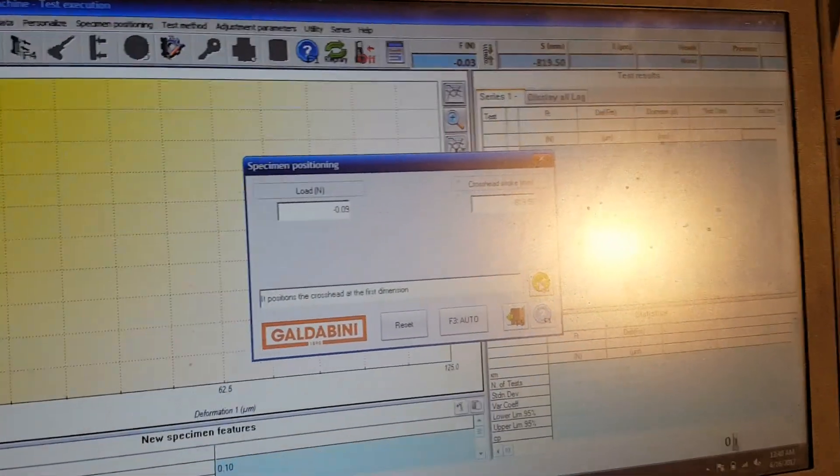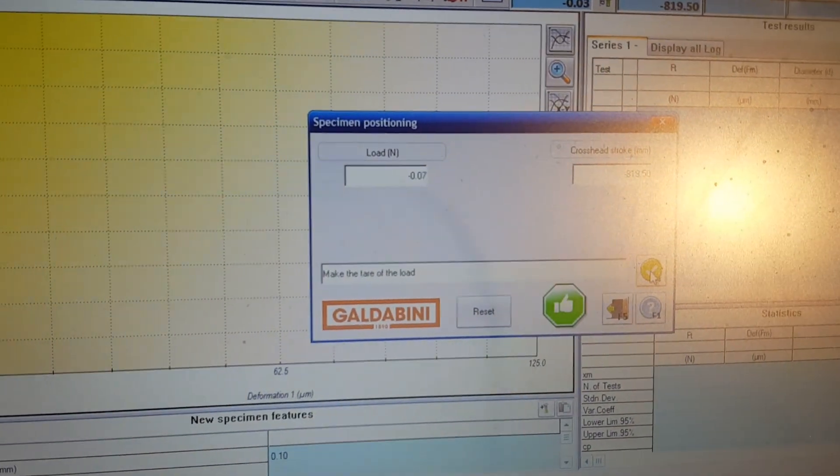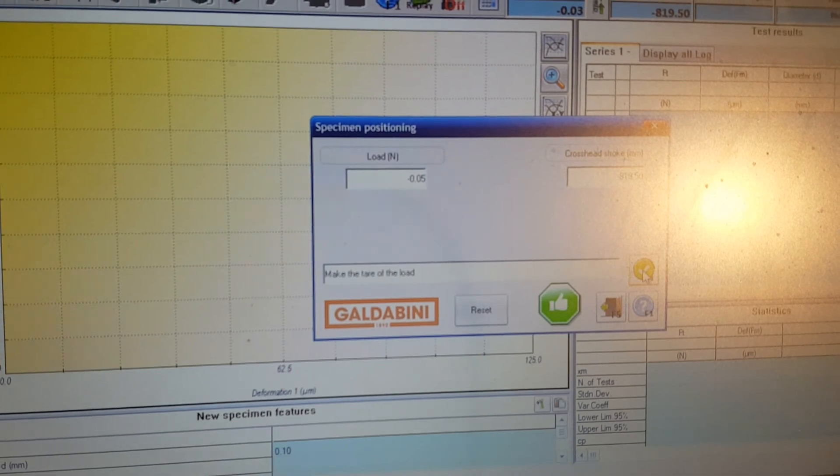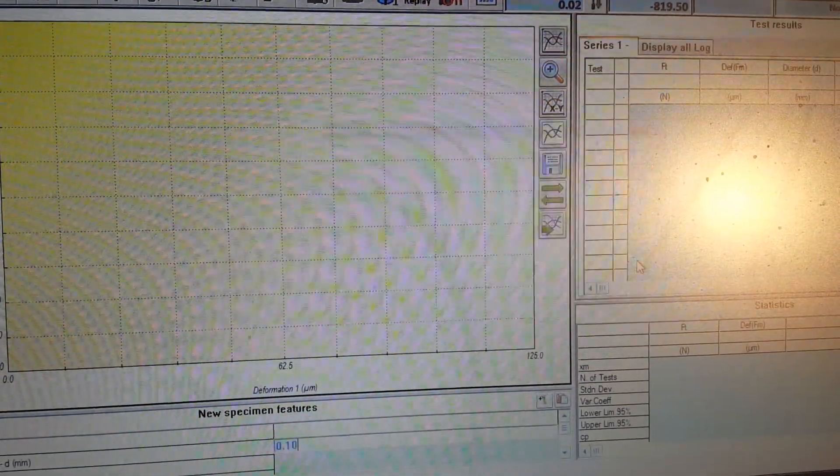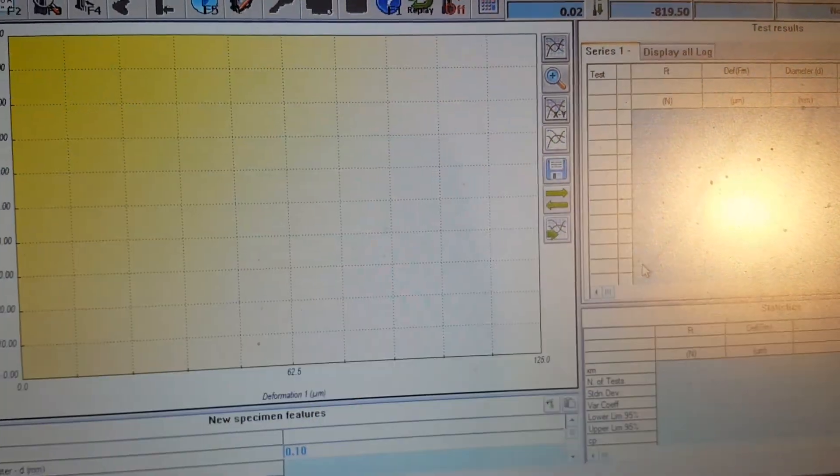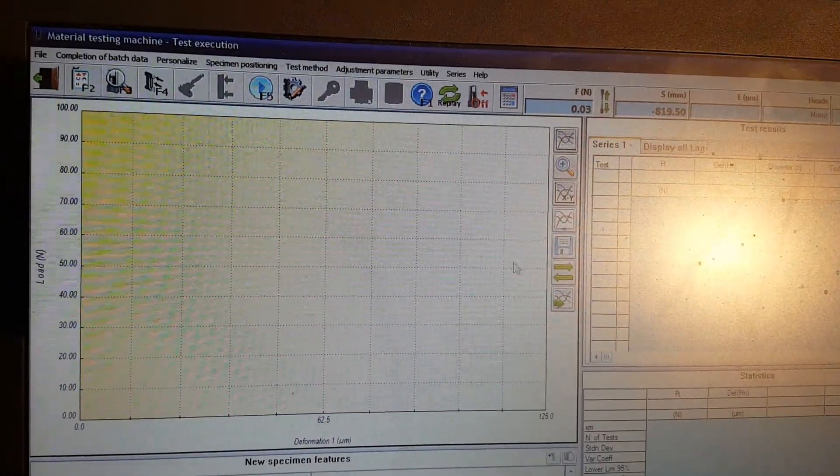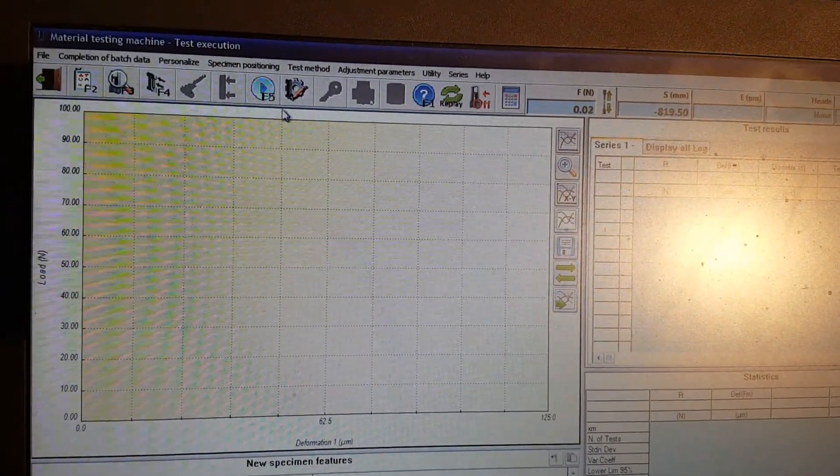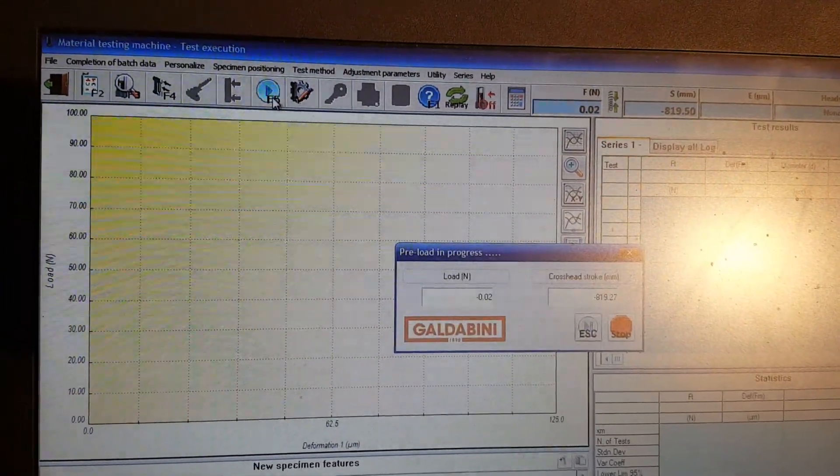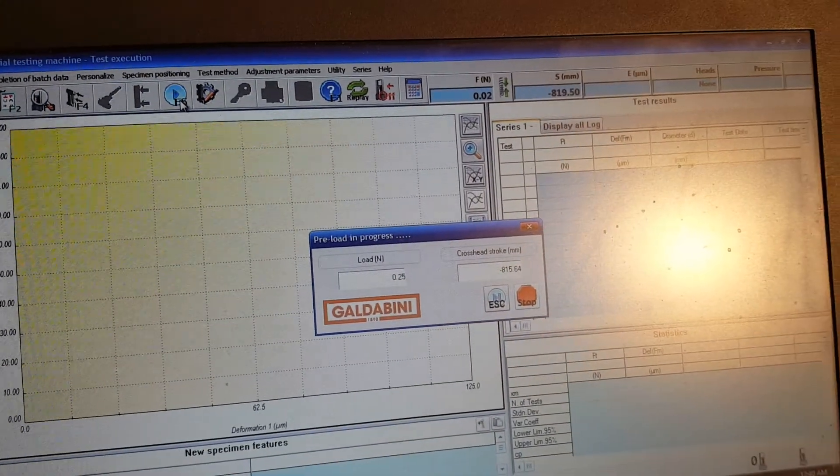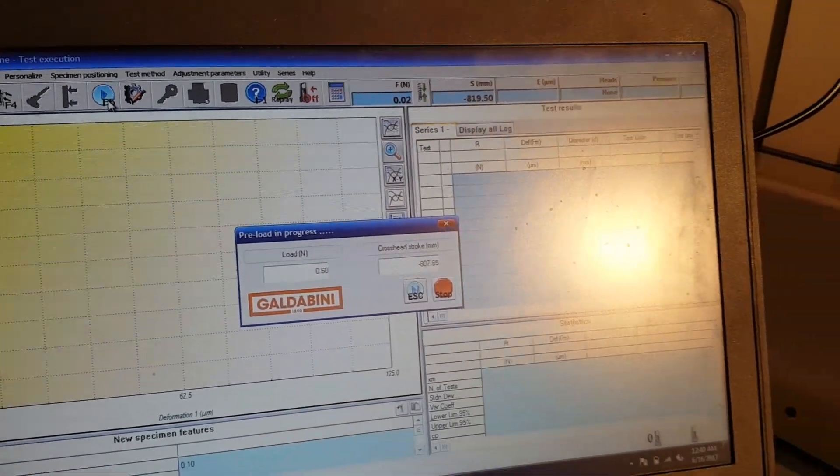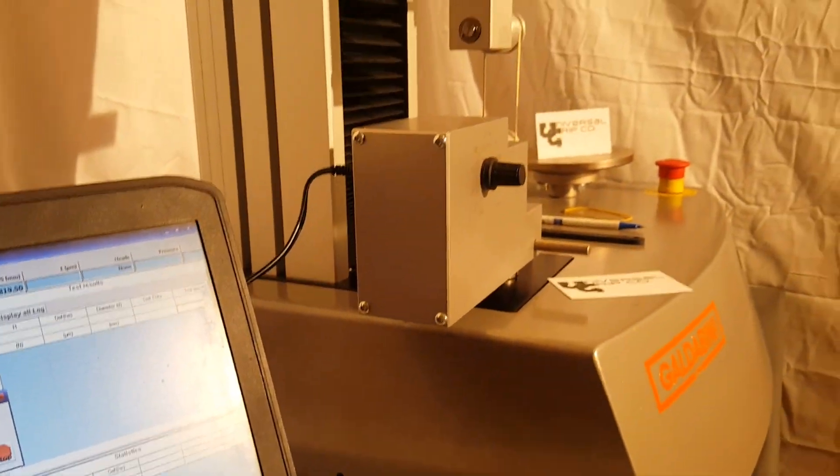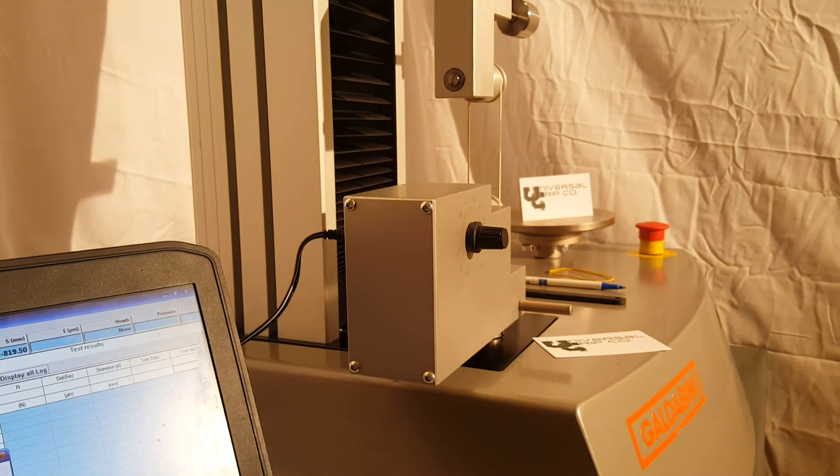First we tell the machine that the sample's in and ready, and then it also zeros the load for us. Then we press this F5 or play button. I have it set up for a preload of about two Newtons or so, and then it will begin the test.